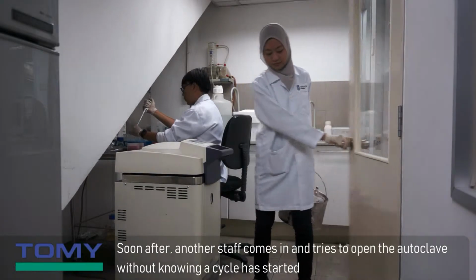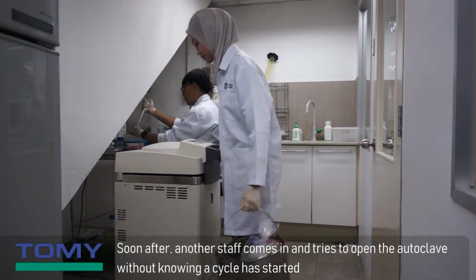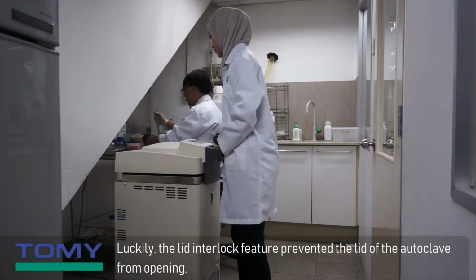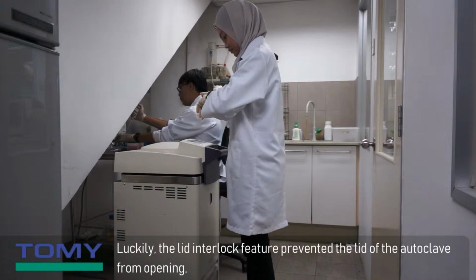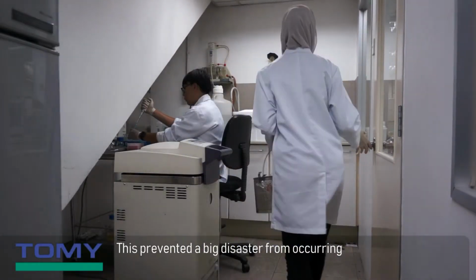Soon after, another staff comes in and tries to open the autoclave without knowing a cycle has started. Luckily, the lid interlock feature prevented the lid of the autoclave from opening. This prevented a big disaster from occurring.